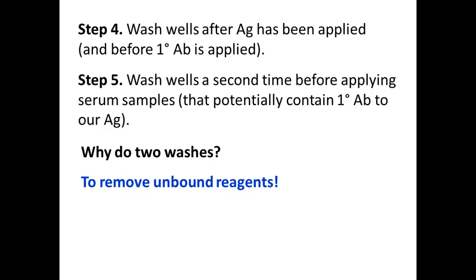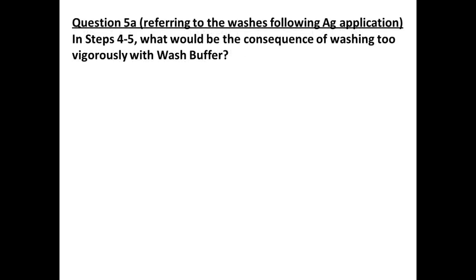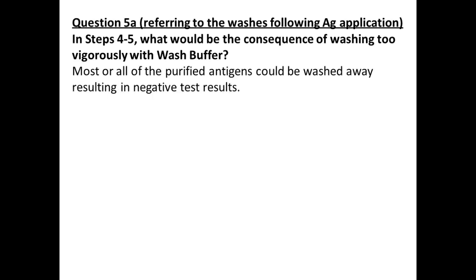So to remove any unbound reagents. Every time we wash, it's stuff that's not actually binding what it's supposed to bind to. If it's free in solution, it's not sticking, then it gets washed out. Because otherwise it's going to mess up our sandwich, right? So what happens if you wash too much, though? You could wash out all your stuff, right? And then you're going to end up with what type of results? Negative results. Those would be false negative, would they not?